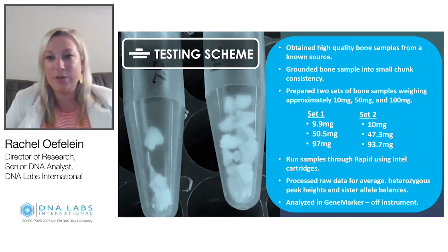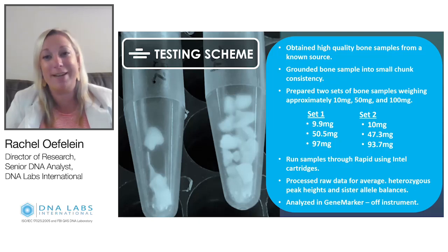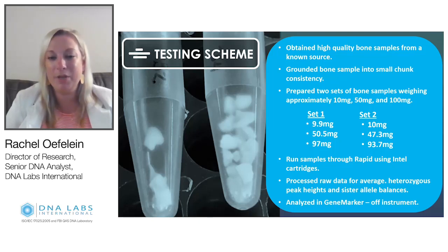I say approximate, and you can see that they're pretty close, but when you're dealing with bone chunks, it's virtually impossible to get it to weigh exactly the same. So there's slight variation there, but they're pretty close.